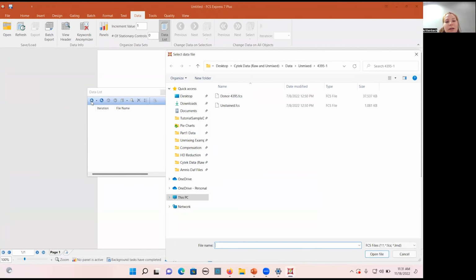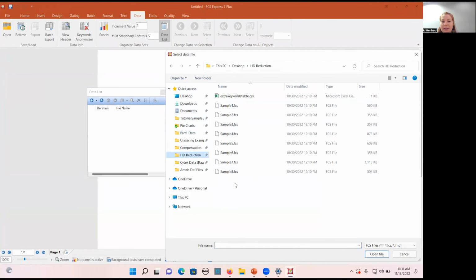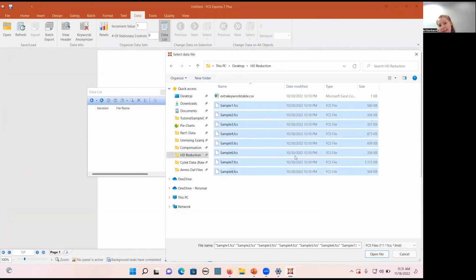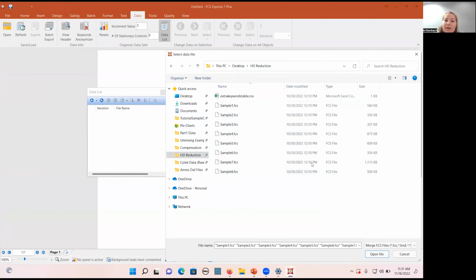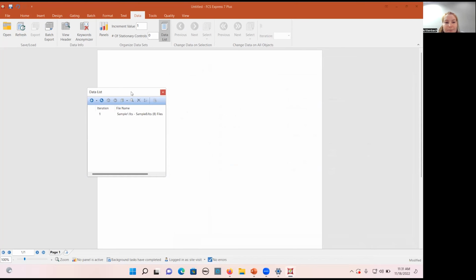So I'm going to click on this plus sign, and I have all of my samples here. So I'm going to highlight all of my samples, and I'm going to select merge FCS files. And now they are all listed down here, and I'll press the open file. Now you can see we only have this one file, but it is all of our files merged into one.